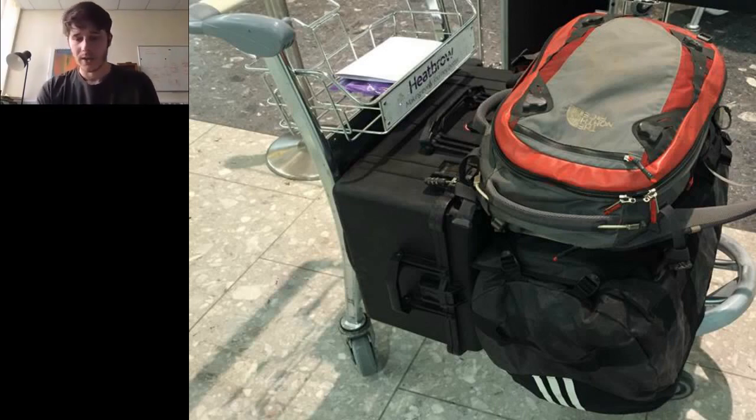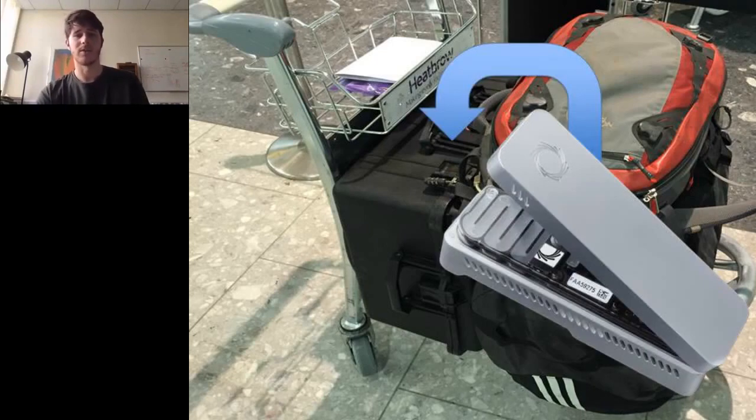So, how did we get to this point, and what did we have to do to put this equipment together? I'm going to go through some of the key things. I've already mentioned the reason that we chose the MinION is because it's a very small instrument compared to the previous generations of instruments. It's very lightweight and requires fewer support equipment, so it doesn't require mains power, which makes it very good for an environment where there might be frequent power cuts.